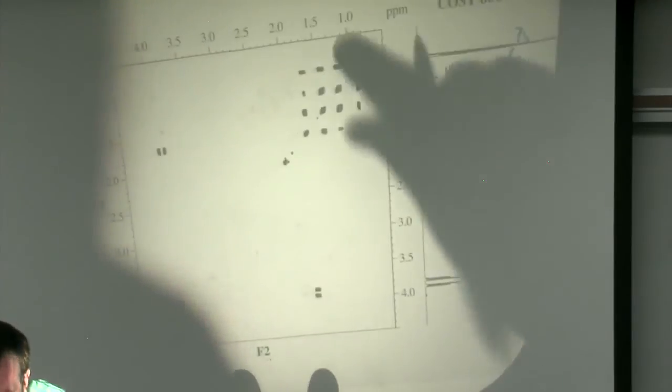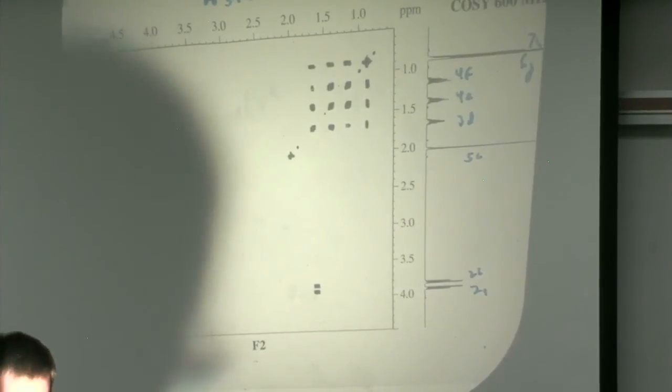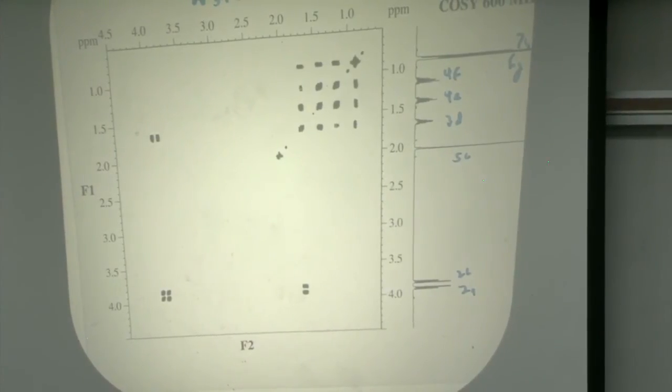And if I had another axis up here, I would do the same. They only gave us one edge projection. That's not going to matter. All right, we're now all set to put this molecule together.